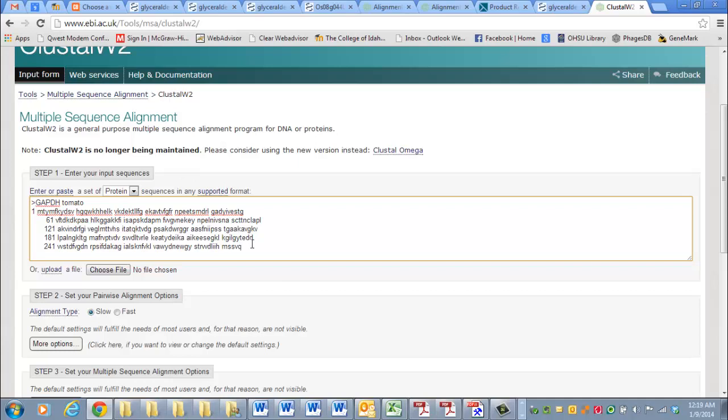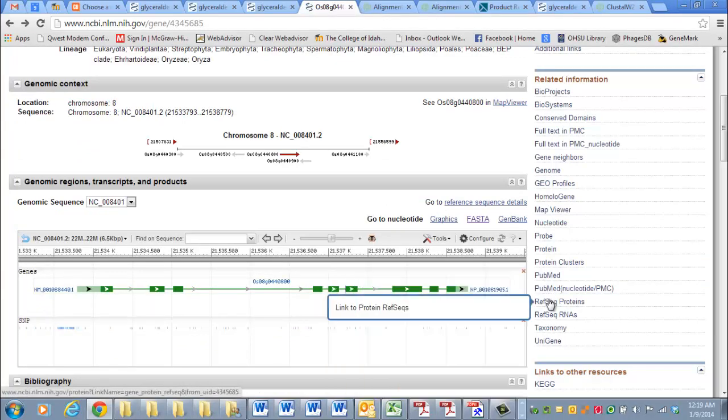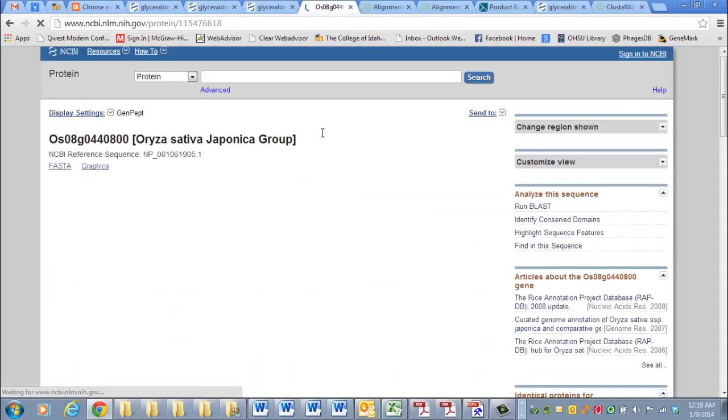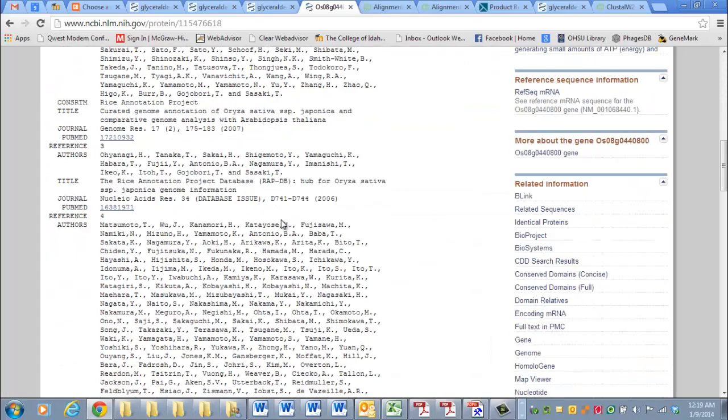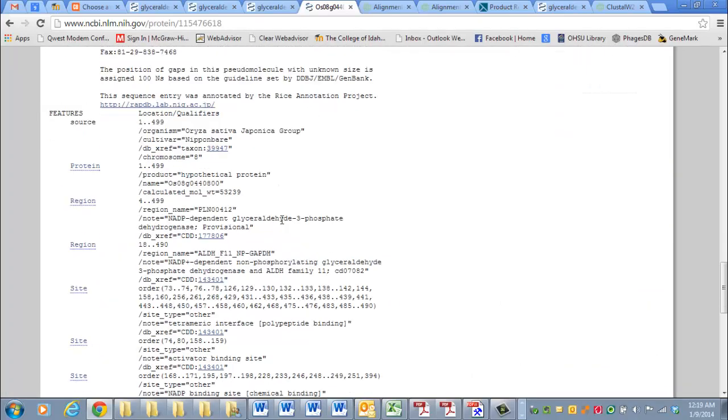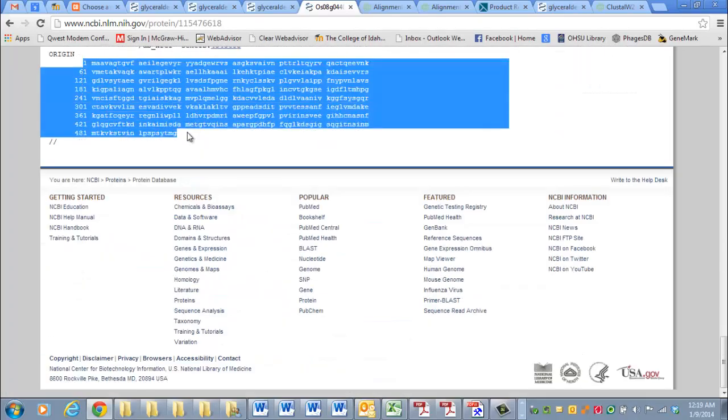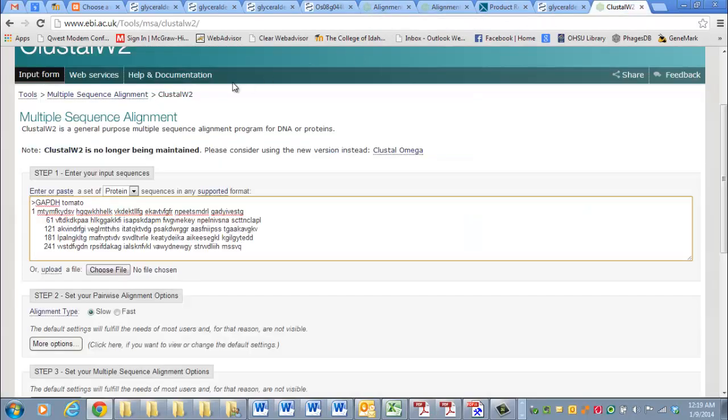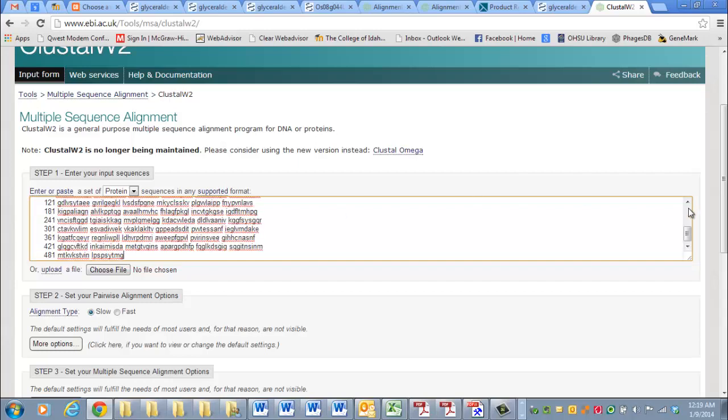And let's say you want to align that with something else. I'm just going to open up another one that I have opened here. RefSeq Protein. It'll bring up some other page with the predicted amino acid sequence for the gene. Copy the sequence. Leave a couple spaces. Paste it in.